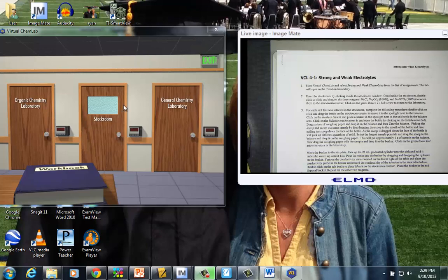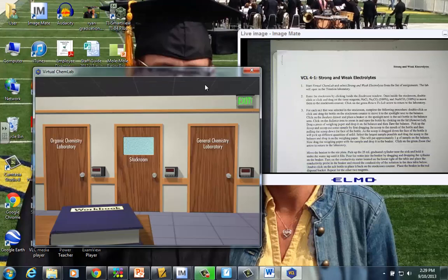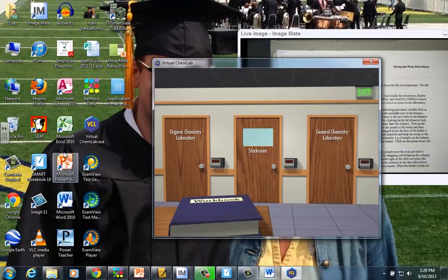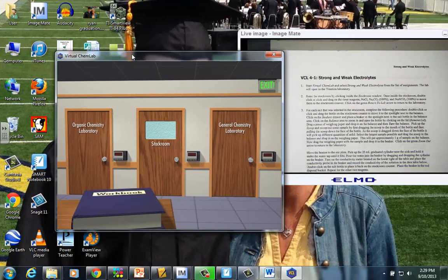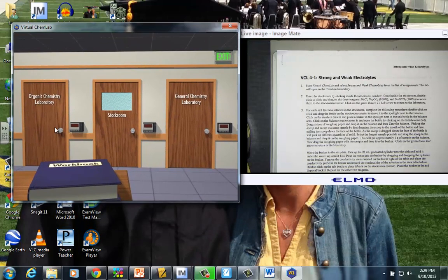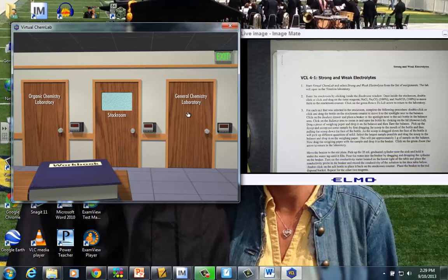So all I've done so far is just kind of clicked my icon, the virtual chem lab, and I open up to where we see three doors. We have organic chem, the general chem lab, and the stock room.